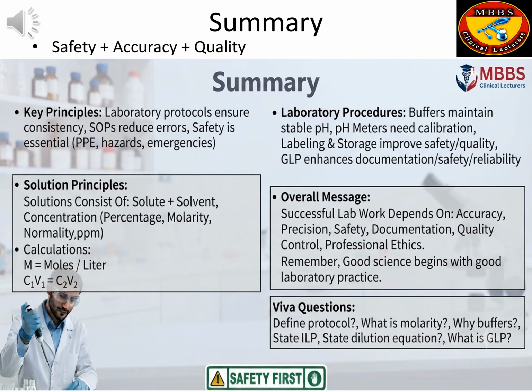Laboratory safety is essential and includes wearing PPE, understanding hazards, and following emergency procedures. Different laboratory solutions include stock solutions, working solutions, standard solutions, buffer solutions. Every solution consists of solute, solvent.